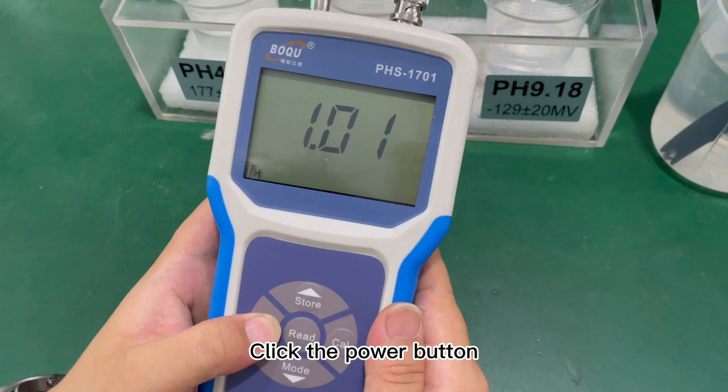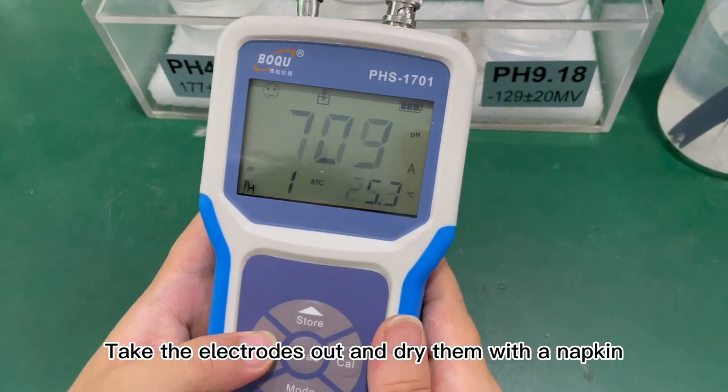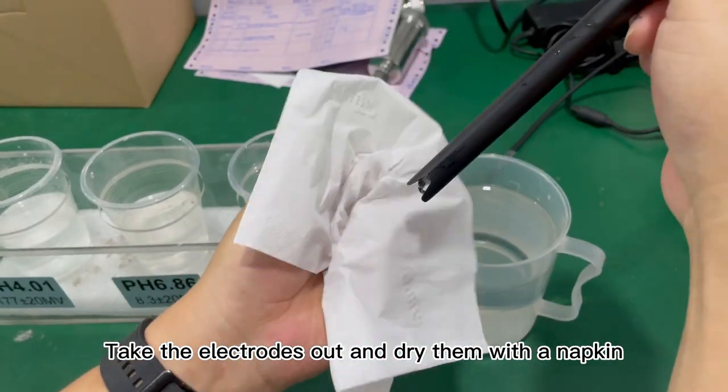Click the power button and enter the display page. Take the electrodes out and dry them with a napkin.